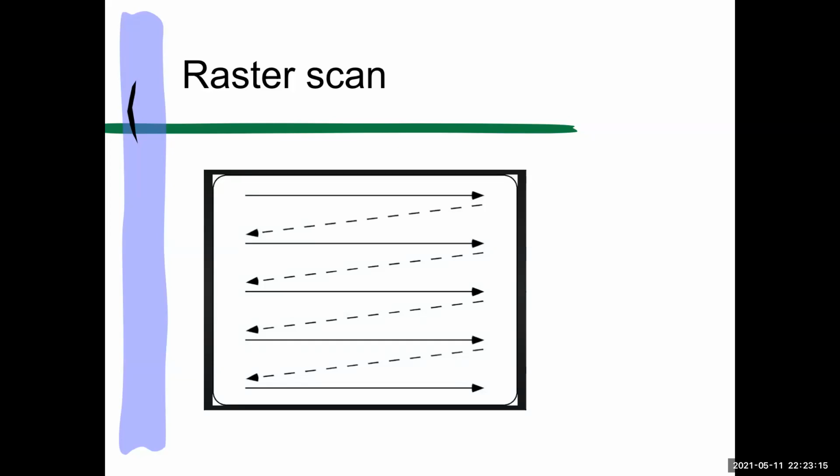And all of this, this sort of big leap in technology, happened because of fluorescent proteins driving the need for confocals, so that it wasn't just a select group of several hundred very patient grad students who were willing to spend 6 hours watching the focus knob, in my case, on my scope to get one image, and go through 2 operating systems in 30 minutes once I finished the scanning to visualize the image. You know, it takes a certain mindset to be willing to do that.